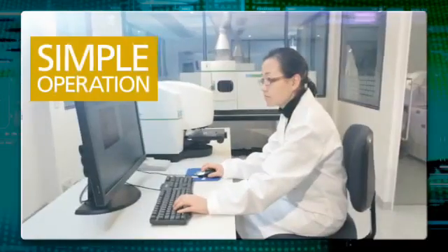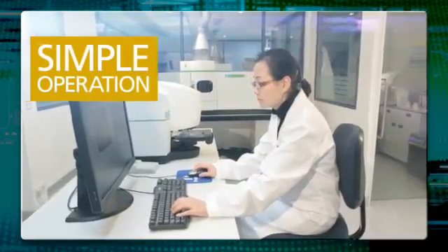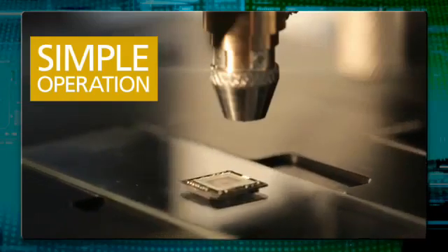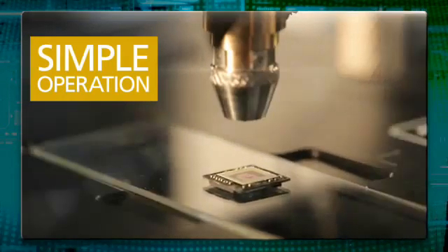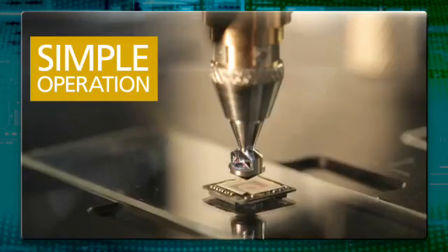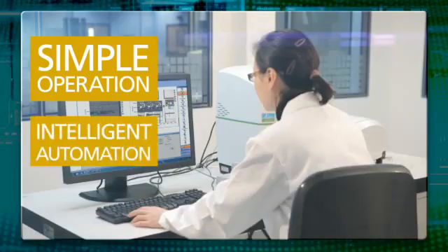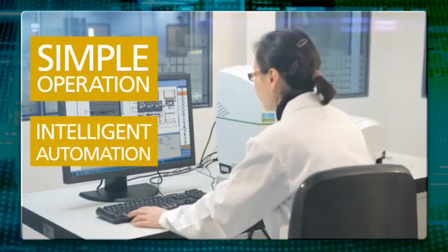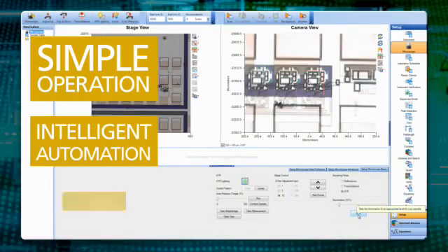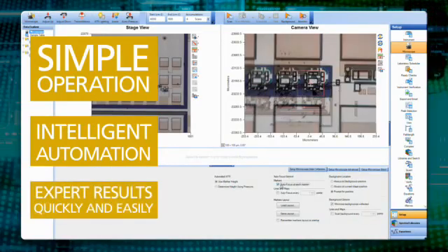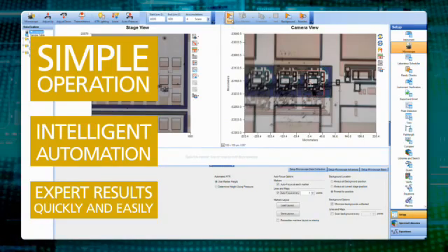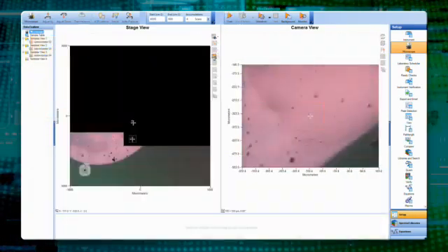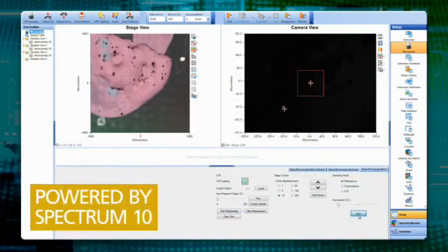Designed for lab scientists facing increasingly challenging samples which demand higher sensitivity yet simpler analysis and workflows, the Spotlight Microscope Systems provide scientists of all skill levels faster, more intelligent automation, state-of-the-art technologies, easy-to-use software, and simple tools for setup, method development, and data analysis, allowing you to get expert results more quickly and easily.